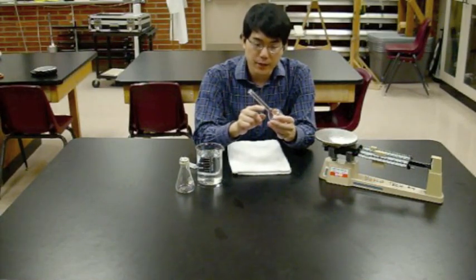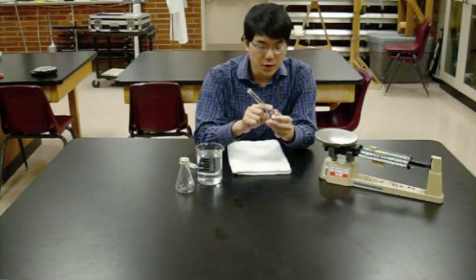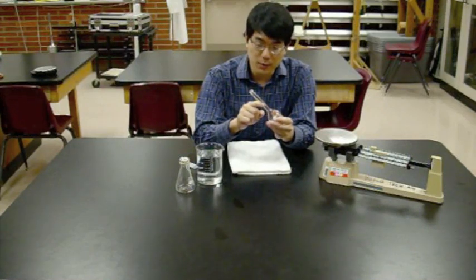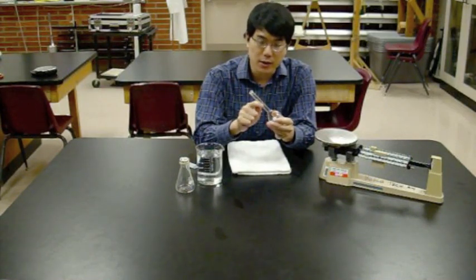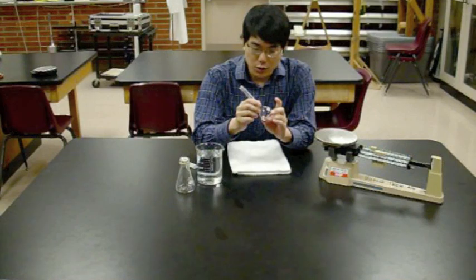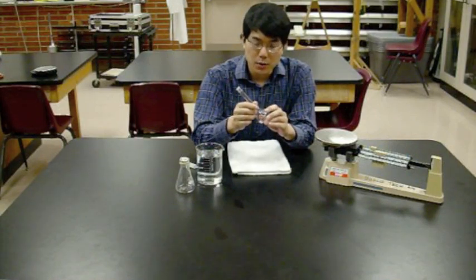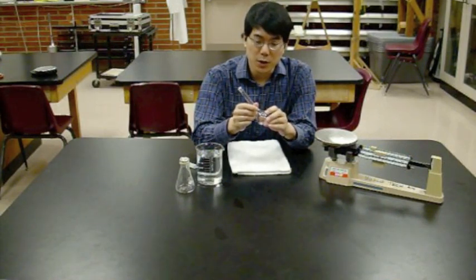Along the tube-shaped portion of the volumetric flask, you'll see a ring-shaped scratch. That's the fill line. That means that when you fill the flask so that the bottom of the meniscus is at the fill line, you have exactly the volume that you're supposed to get out of the volumetric flask.